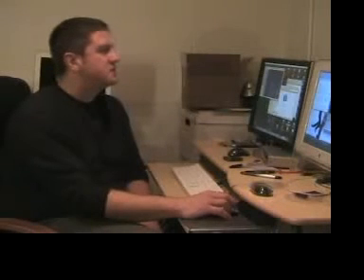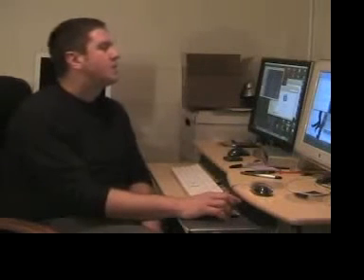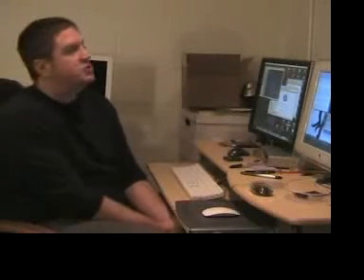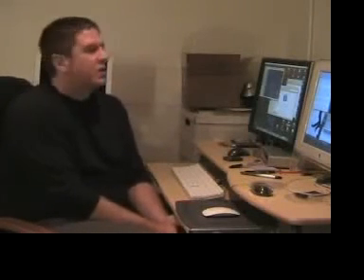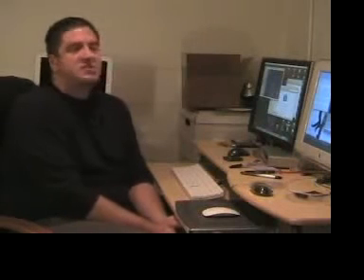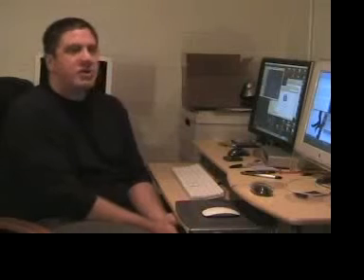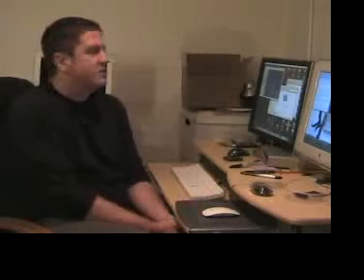The process is fairly straightforward, but there's a little explanation involved here. The photographs weren't taken with a consistent spatial relationship between the camera and each sample. As a result, there are variations in the size of each sample as represented by each digital image. To compensate for this, each image has to be normalized so that the green pixels counted are relative to a consistent size reference.